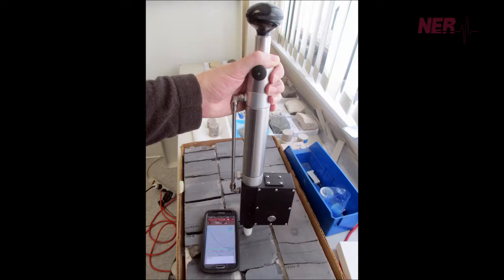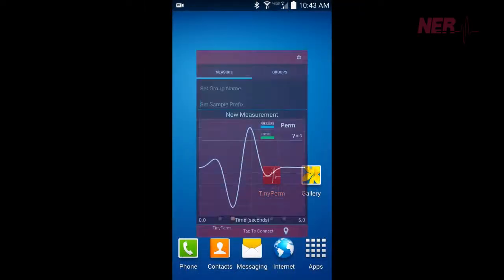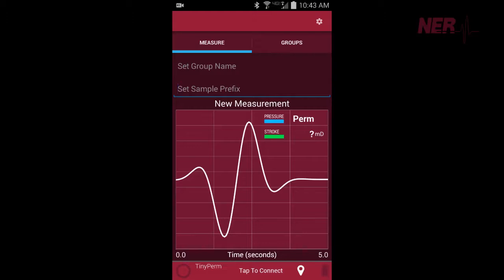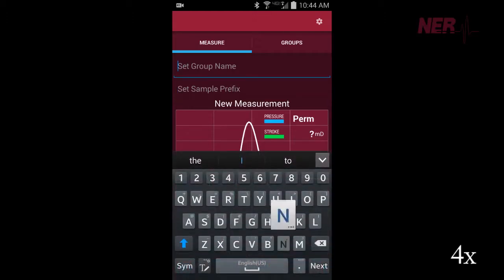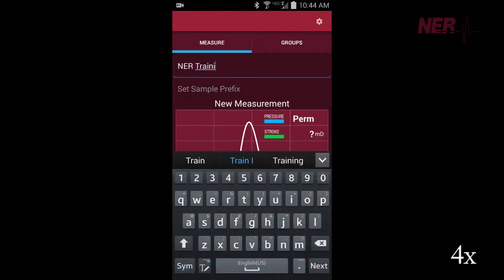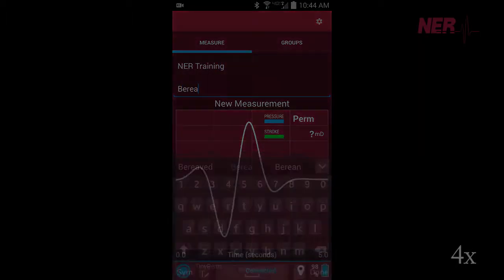The TinyPerm 3 connects to an included Android device, communicating wirelessly with the permeameter. Measurements are organized by group and sample name to be easily accessed after field measurements are concluded.